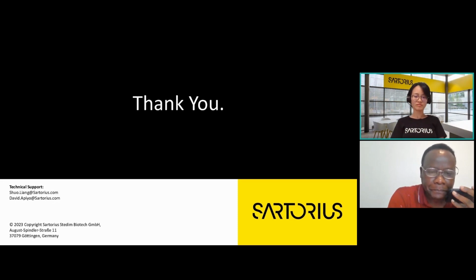Okay, thanks, David. The next question is, how does one select the most appropriate biosensor surface for antibody characterization on the Octet? And which biosensor surface can be used in characterization of diagnostics reagent?